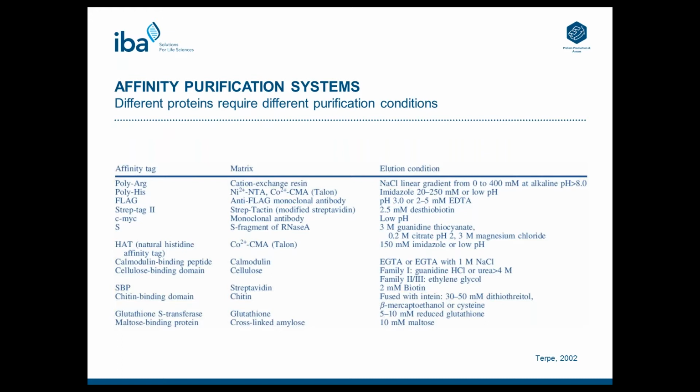When starting with the purification of a new protein, where the optimal purification conditions are unknown, you should think about different purification tags, because not all tags are suitable for all kinds of protein classes or compatible with downstream applications. For example, the His-tag is not recommended for metalloproteins, because the metal center of metalloproteins may be absorbed by the Ni-NTA matrix used for the His-tag purification.